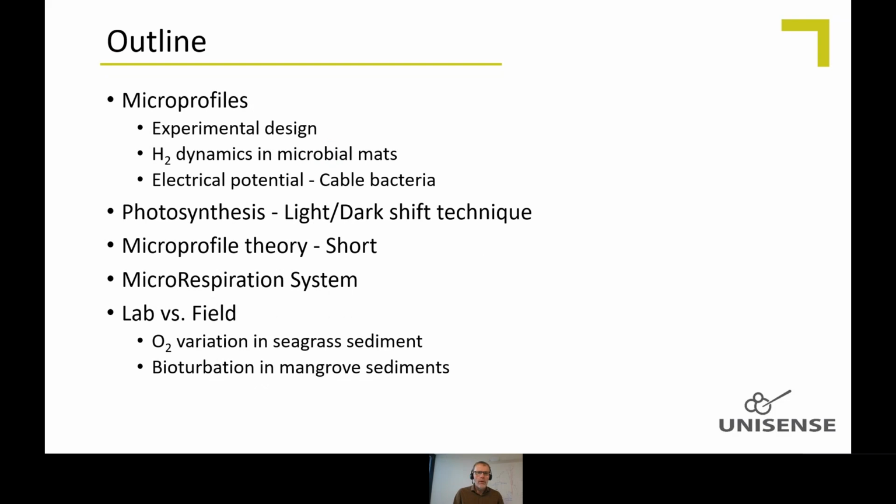In this presentation, I will talk a lot about microprofiles, what the experimental design should be, and how you should think to get good microprofiles. Some examples from hydrogen dynamics in microbial mats, and something also about the electric potential generated by cable bacteria. Then I will talk about photosynthesis measurements using the light dark shift technique, which is a really strong technique for this. Then a bit about microprofile theory.